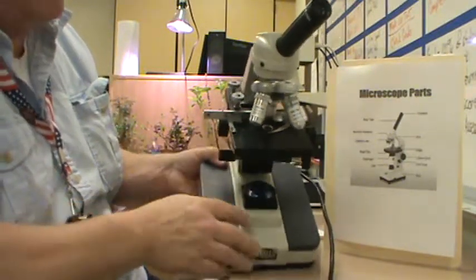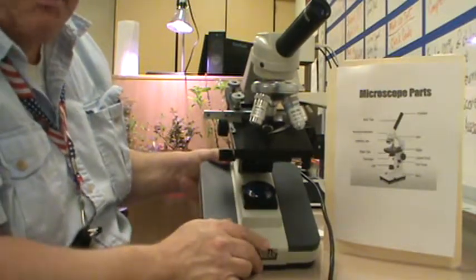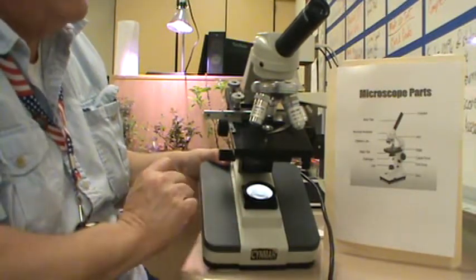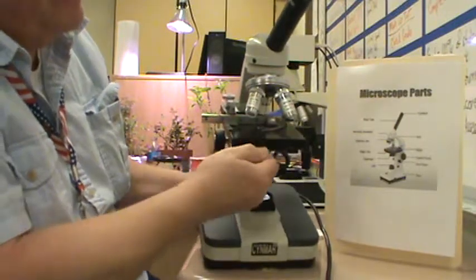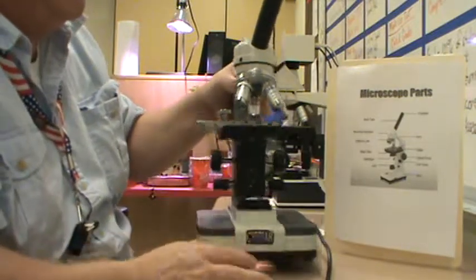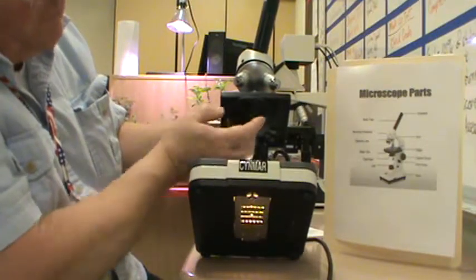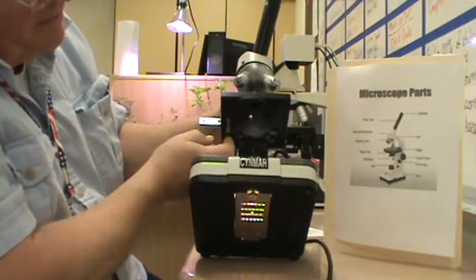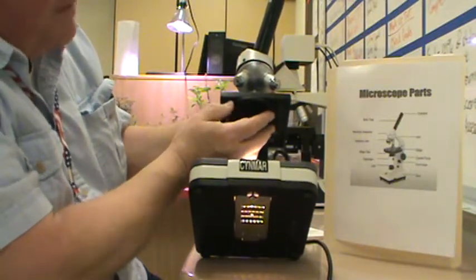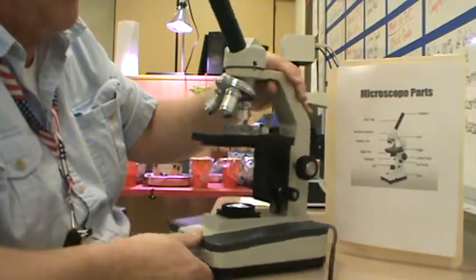Speaking of light, we have a light source. Now in some places I noticed online, they'll call this the illuminator. Ooh, it provides illumination. And then this dial is called the diaphragm. The diaphragm, and let me pull this back a little bit so you can see up underneath. The diaphragm has different size holes so that you can set the amount of light that you would like to come from the illuminator or the light source up through the aperture and to illuminate or to show your specimen.